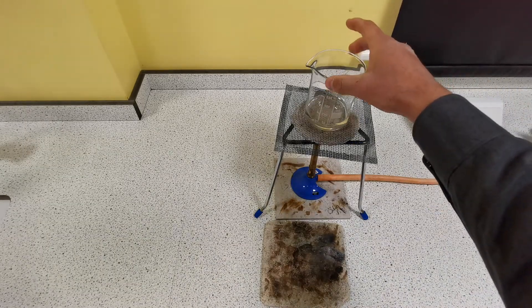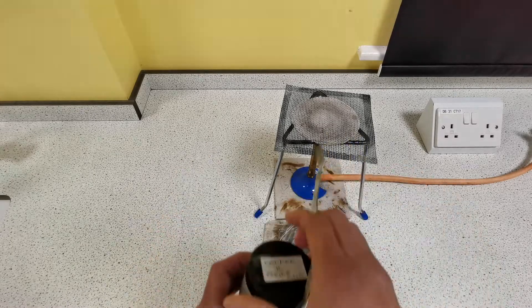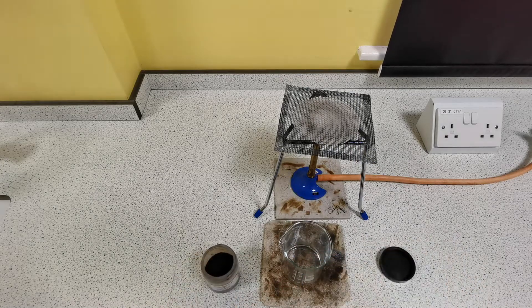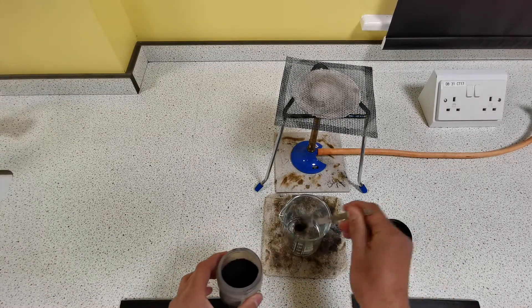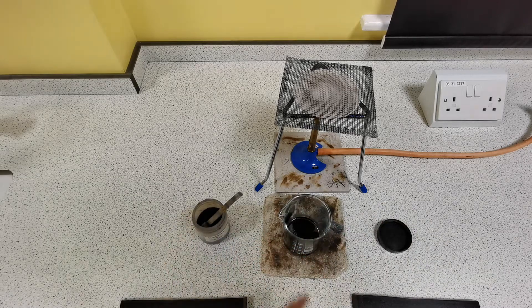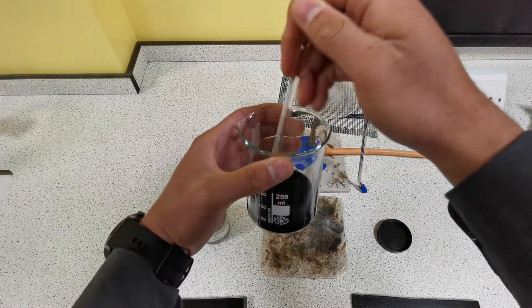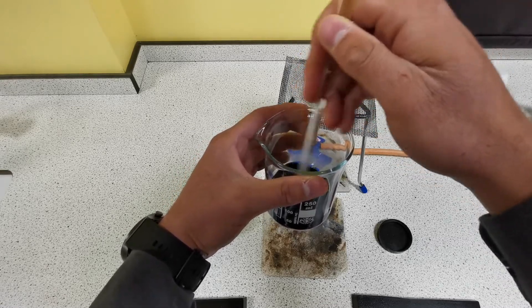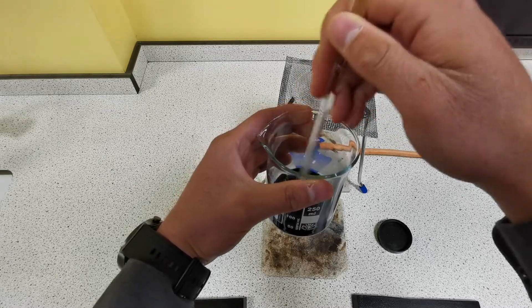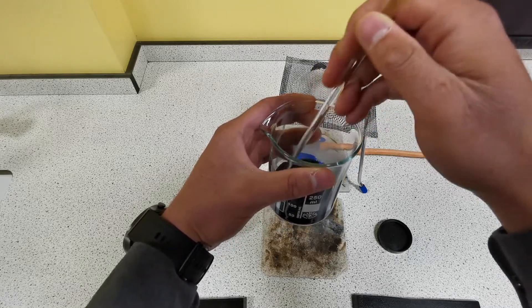The top of the beaker should be relatively cool. We're going to move it onto another heatproof mat and we're going to add a spatula of copper oxide and stir using the stirring rod. When a metal oxide reacts with an acid, a salt and water are formed. So when copper oxide reacts with sulfuric acid, copper sulfate is produced as well as water.